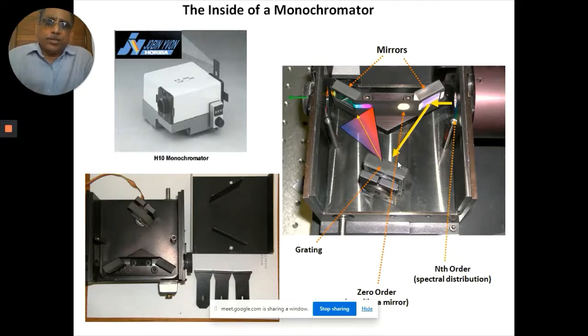I thought it would be comprehensive, and it will also give you a very good foundation, because as chemists we don't get an opportunity. As physicists, people probably learn about it, but anyhow, I've given you complete, exhaustive details about these monochromators and also about the grating.